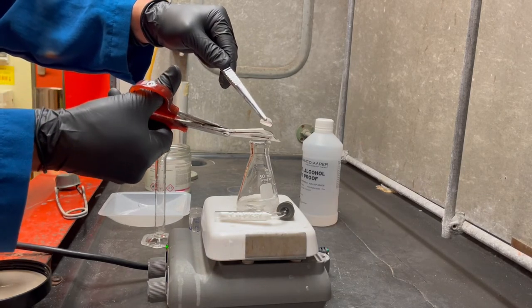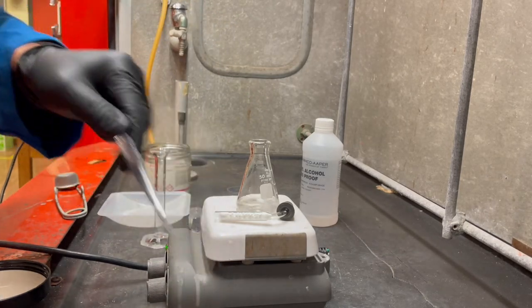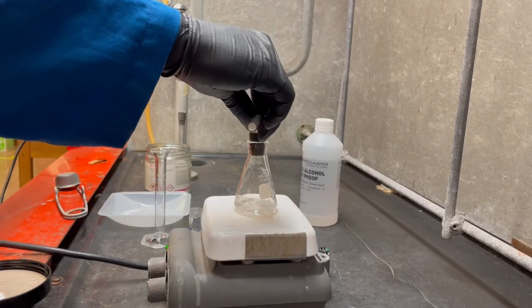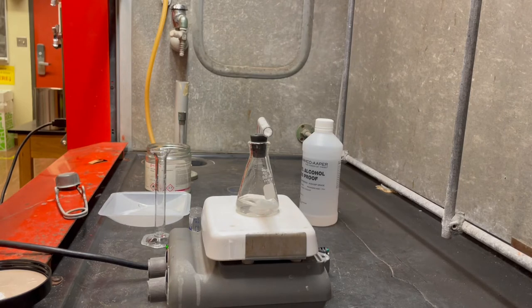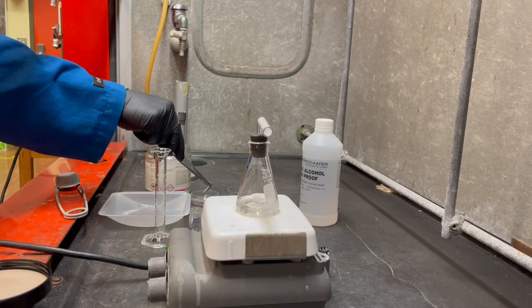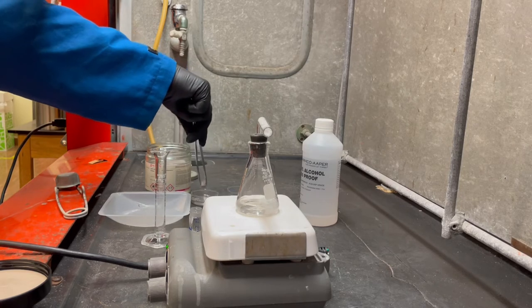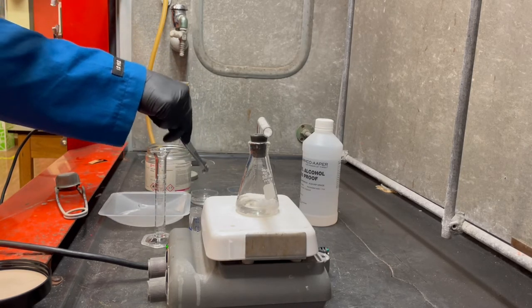So we cut it into smaller pieces that can react more quickly with the ethanol. Okay. And so it's kind of boiling or bubbling at a good rate now, and so I don't want to put too much in there at the same time because it is an exothermic process, and if you have a highly exothermic process in the presence of hydrogen, as we know, hydrogen is flammable, and so we could spark a fire, and I don't want to do that, right?